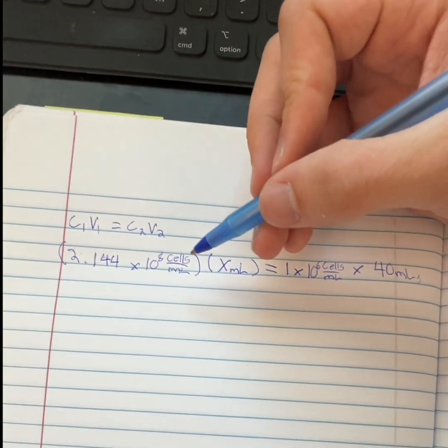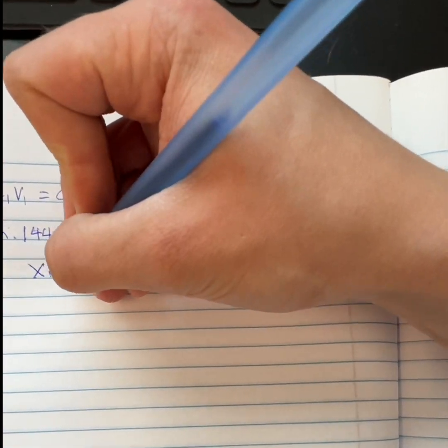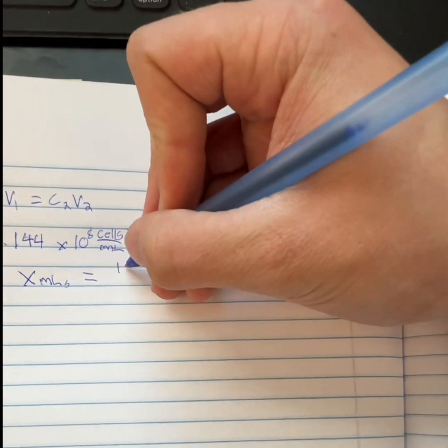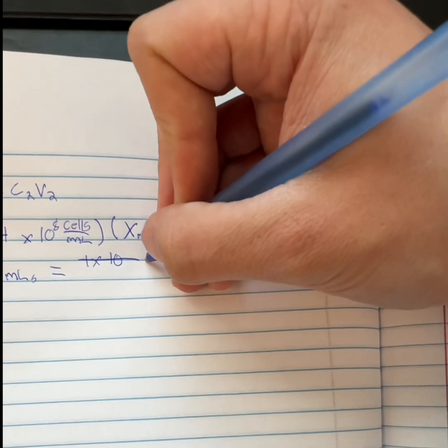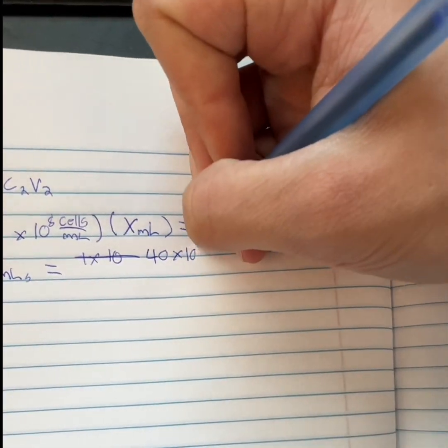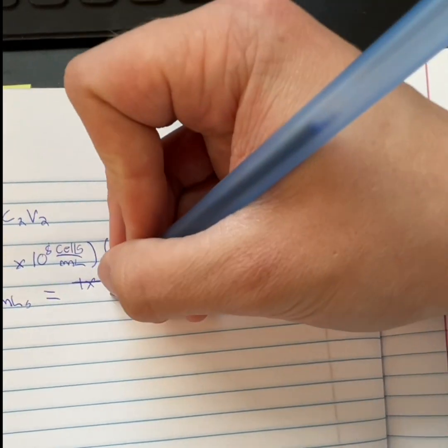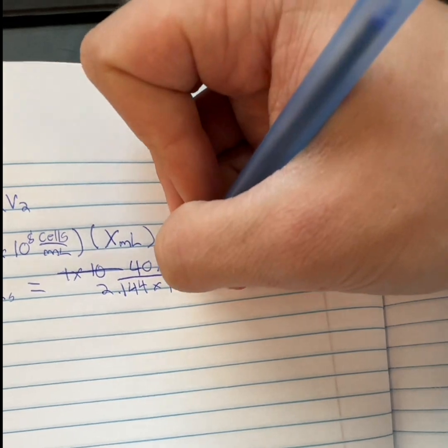All right, so now to solve for X, we're just going to do X mils equals 1 times 10 to the 6th, 40 times 10 to the 6th, because this times this, divided by 2.144 times 10 to the 8th.